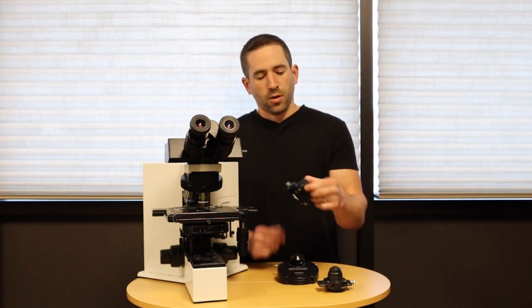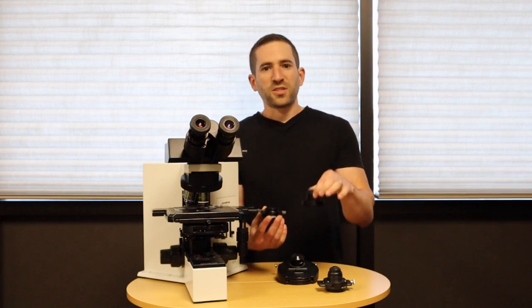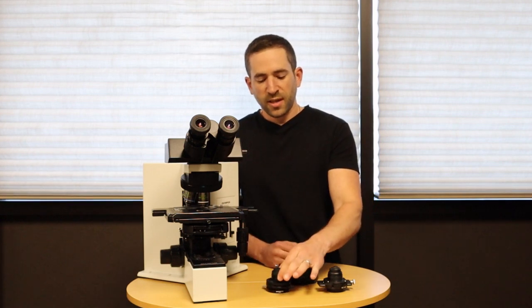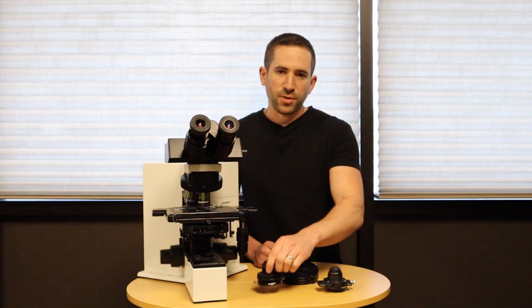More economical options are out there. That involves individual snap-on pieces to match each objective. It's not really practical or realistic, as you have to keep these pieces around and have to swap them each time you rotate the objective.